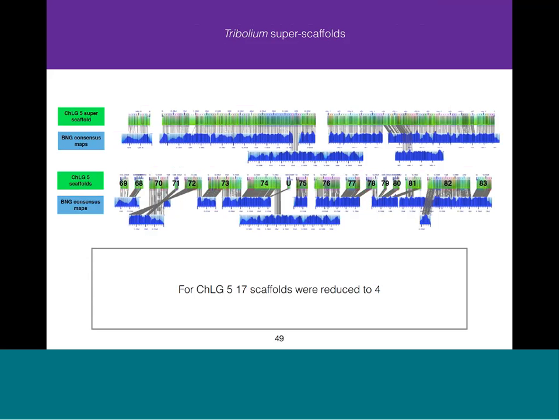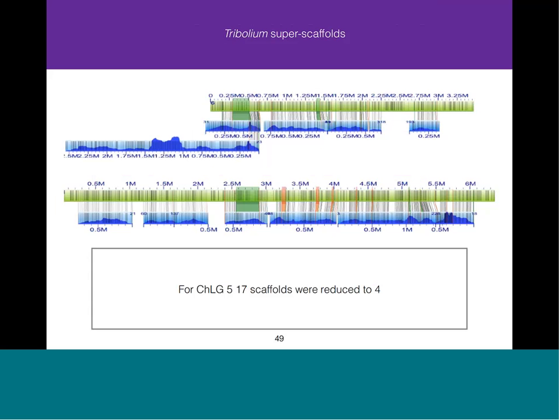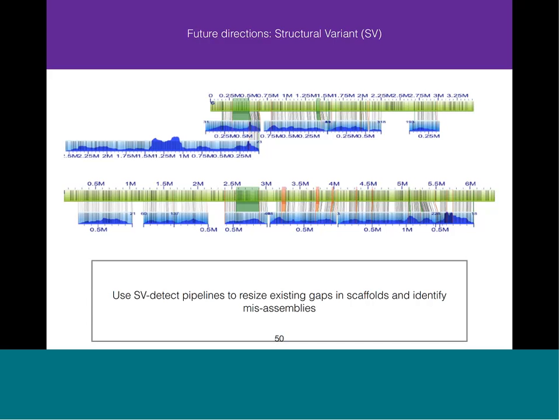And that just brings me to future directions. Now we're pretty comfortable with our scaffolding pipeline. We're interested in what kind of changes we can make internal to those scaffolds. A scaffold from a FASTA file will have a gap region labeled within, and we've just gotten an SV detect pipeline from BioNano from the computational biology division, and Pollock has been really super helpful in showing me how to use it.